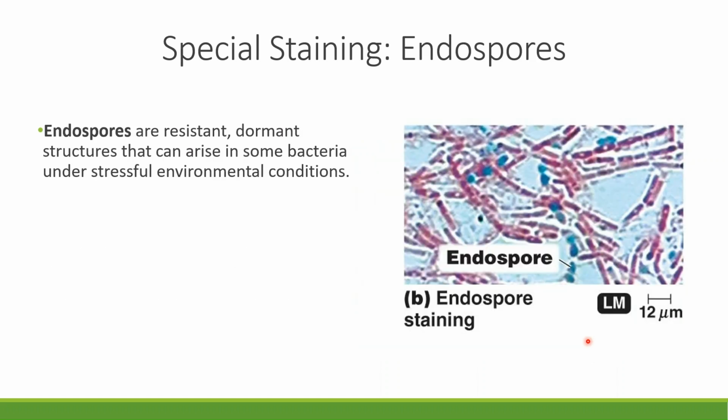The next stain is endospore staining. Endospores are another structure made by the cells. You could think of endospores as sort of like bomb shelters for bacteria, where they can hunker down and survive rough times. These bomb shelters are consequently also very difficult to stain, but it can be done using a lot of heat and time to weaken the structure and allow the dye to absorb.